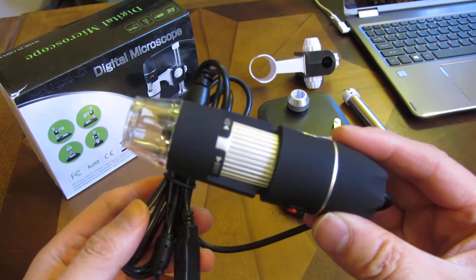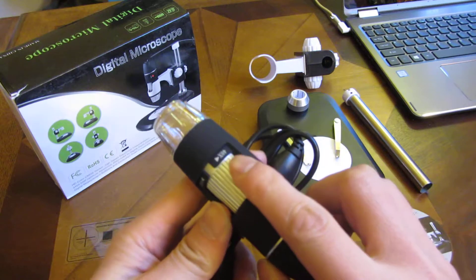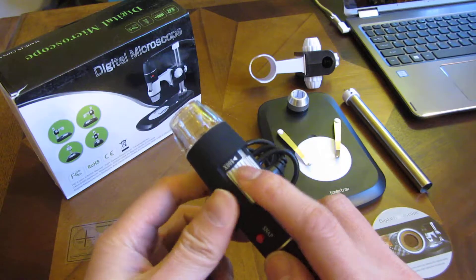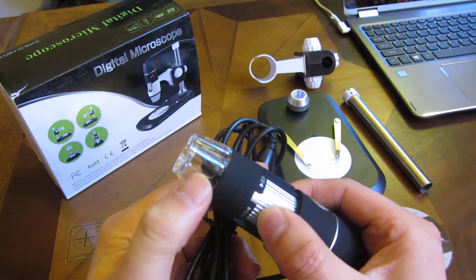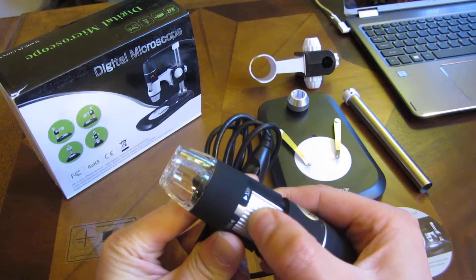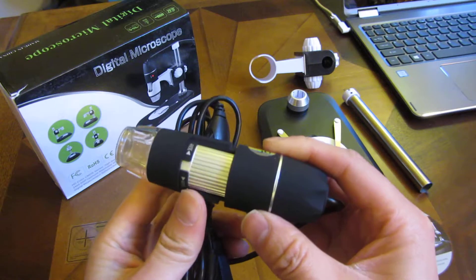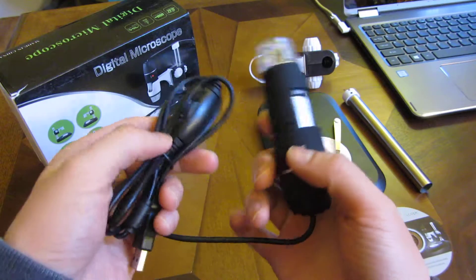This is the main lens and camera. As you can see, there is a 40X here and an 800X. The way to operate this, you can see the camera focusing as I adjust this. That's how this mechanism works, and it goes into that holder right there — I'll show you how to assemble that later.